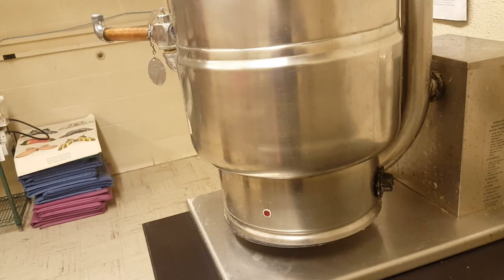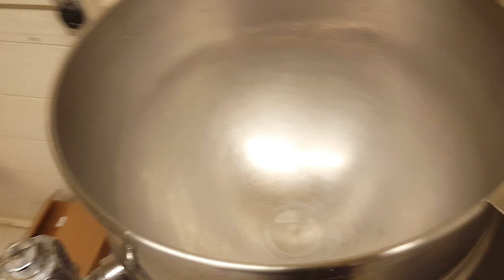Here's our diet making room. We keep all the ingredients down here in these bins, and to make the diet we actually boil all the ingredients together in this big industrial boiler. We add them all together, turn it on, heat them up, and then pour them into these bins over here. The artificial diet is kind of just like jello, but it contains all of the vitamins and nutrients the caterpillars need to grow.